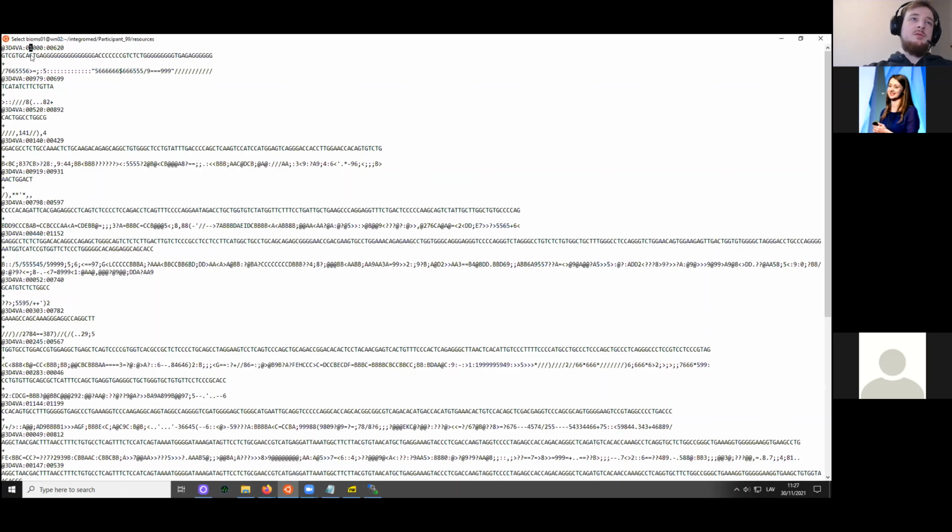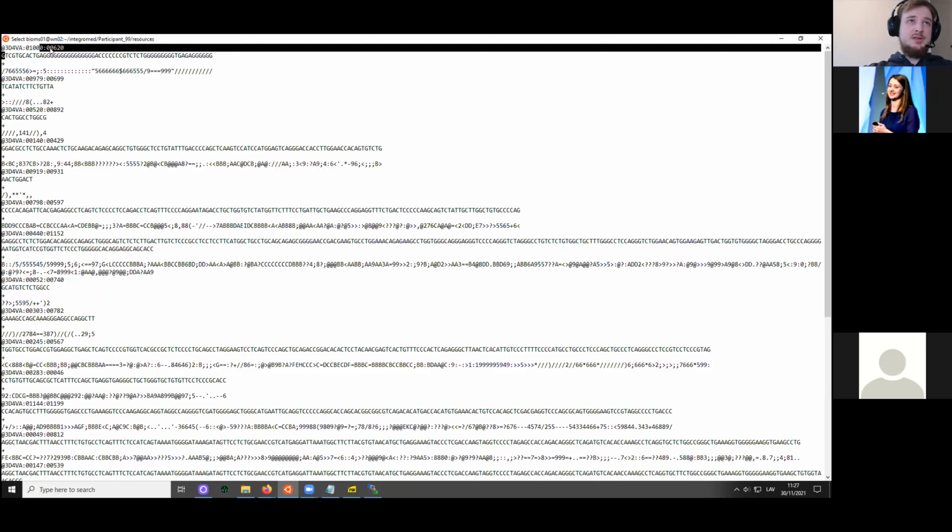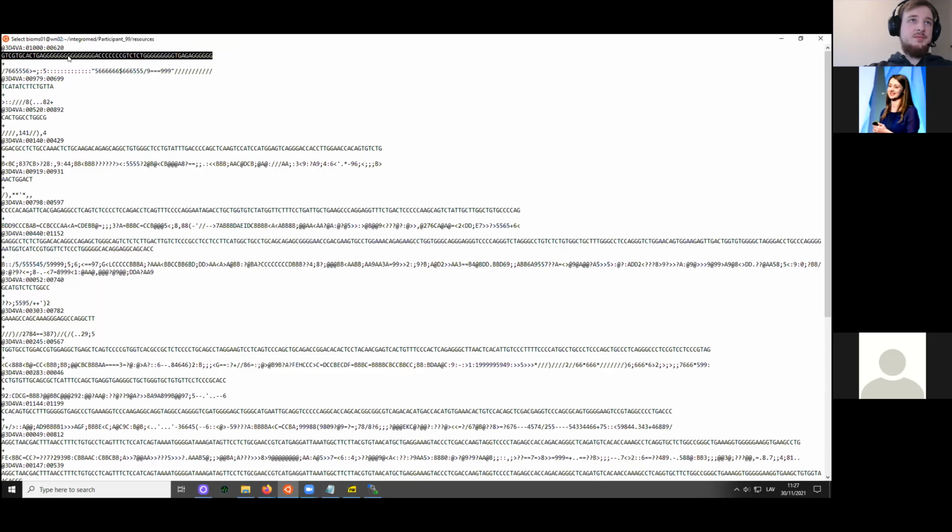These reads are from the Ion Torrent sequencing platform. For different sequencing platforms, the read identifier can be different. This first one is for the sample. This one most likely is for the lane or the run, and this one is the actual identifier for the sequence. Below is the sequence. They are of differing lengths.